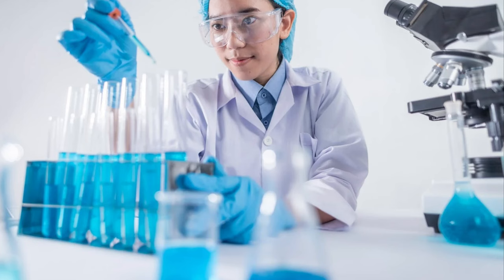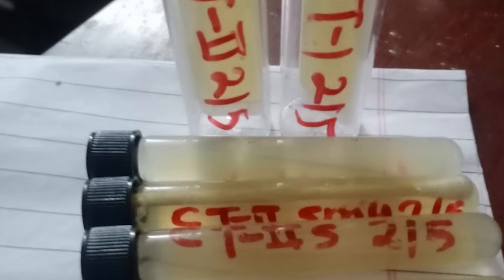The sulfate-reducing bacteria will still be present in our cooling water system. The best method is to fill the sample bottle with water, bring it to the lab with deep care, take 1 ml of water sample through a pipette from the bottom of the bottle, and insert that 1 ml of sample into the agar tube, also called agar ampoules. After inserting the sample, we must add paraffin oil in that ampoule to avoid oxygen entering it. If we don't add paraffin droplets, oxygen will enter the ampoule and kill the sulfate-reducing bacteria immediately, giving us misleading results.